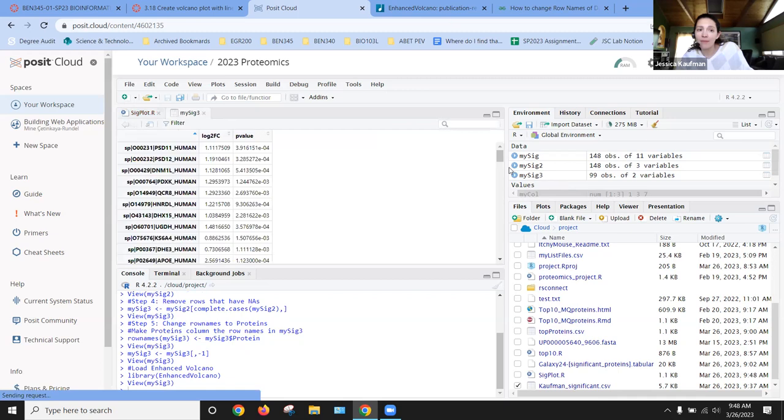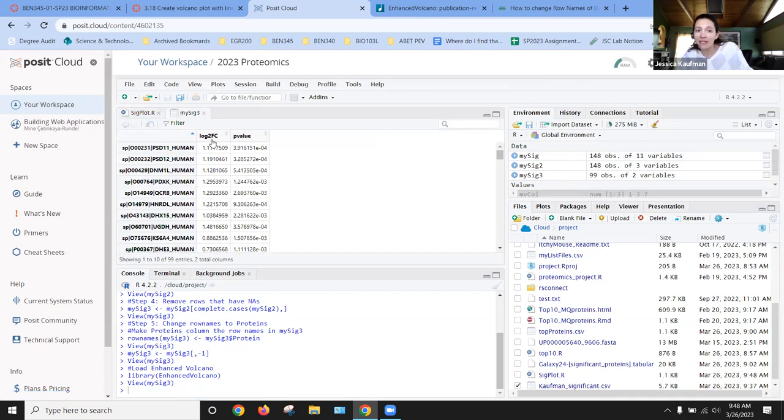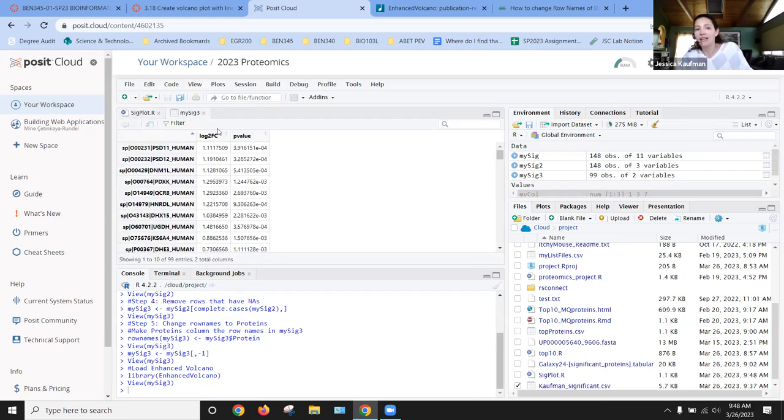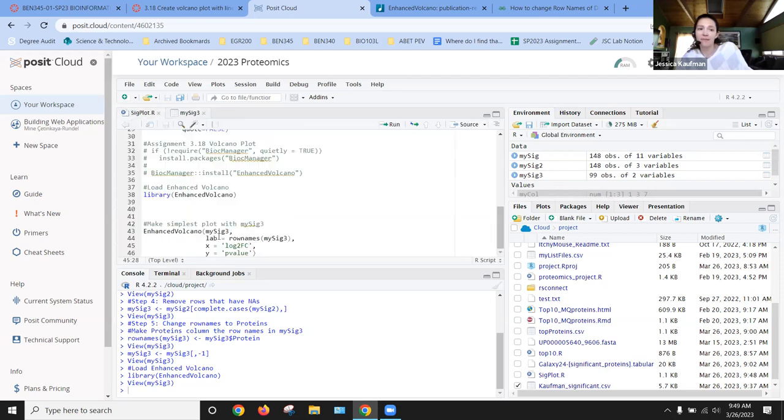So if I open up the data frame, you can see it's not called log2 fold change, it's called log2fc. And then the y value is p-value. Well, that is the same column name that we used, so we don't have to change anything.